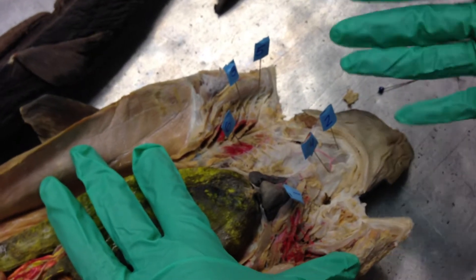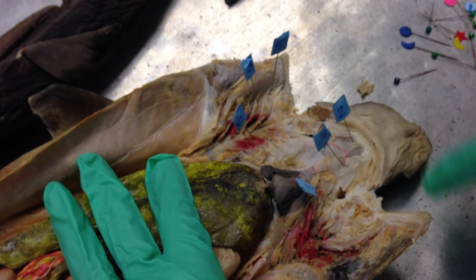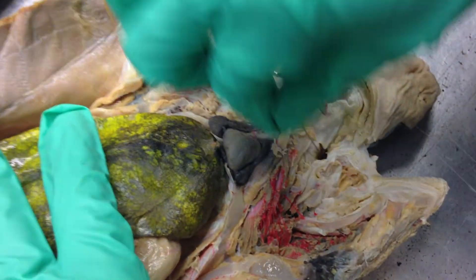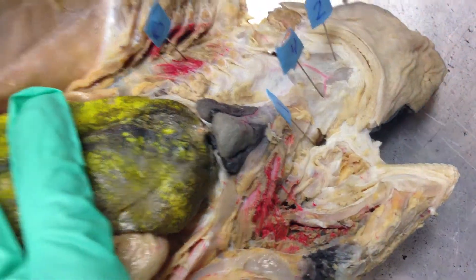So this is our shark. The spiracles are this hole right here at number one that kind of goes in here. You can see them from the outside of the shark — that's a spiracle on both sides.